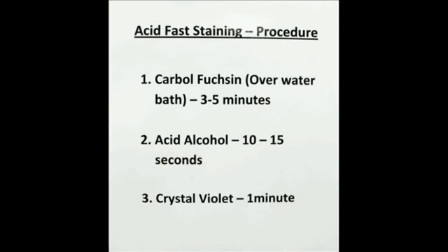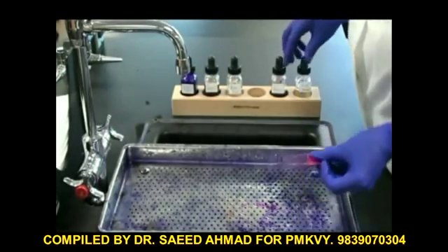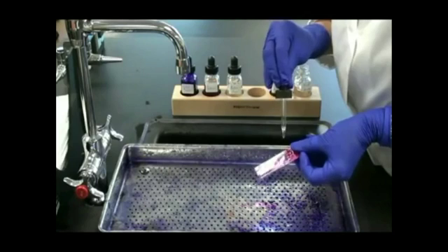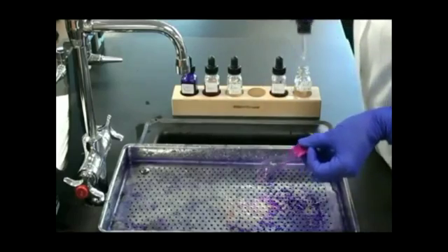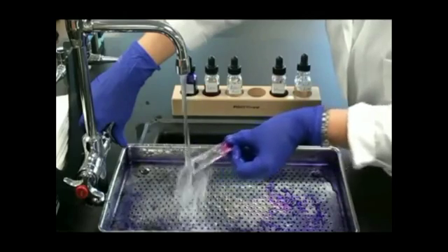Now I'm ready for my second step, application of the decolorizer, acid alcohol. When I apply the decolorizer, I like to tilt the slide downward and drip that decolorizer over the slide so it runs right down. This way I can see the primary stain being removed from the non-acid fast cells. After 10 to 15 seconds of decolorizer, I rinse my slide. I rinse between every step of this procedure.